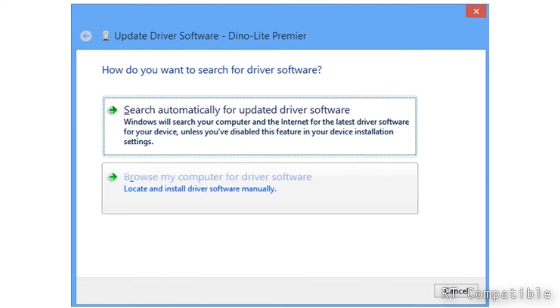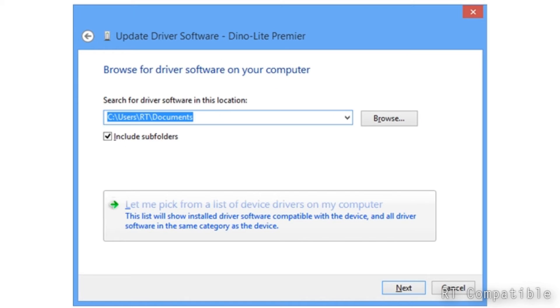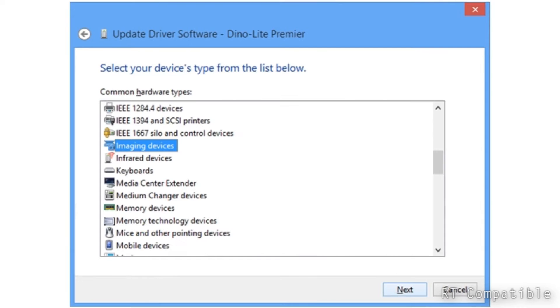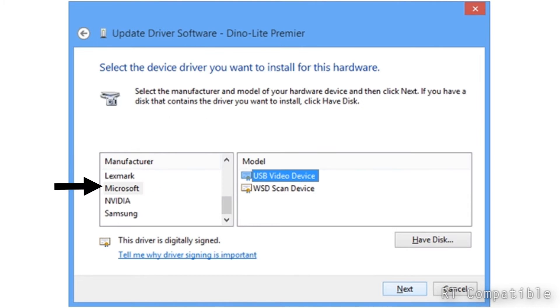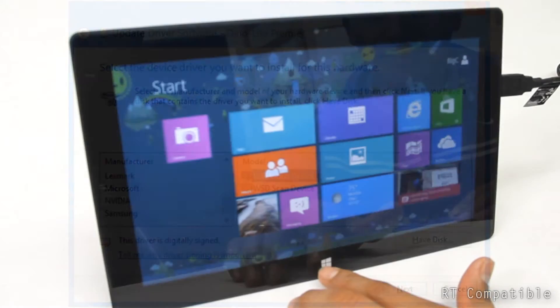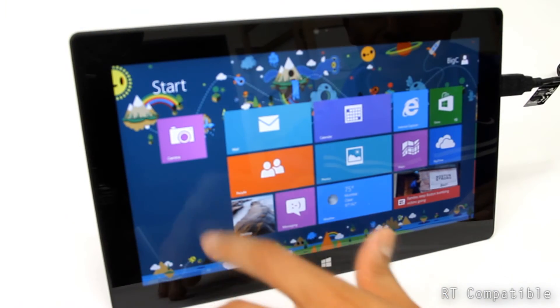Browse the computer for drivers and pick from a list of drivers already on the device. Under Imaging Devices, choose Microsoft and USB Video Device, then select Yes or OK.